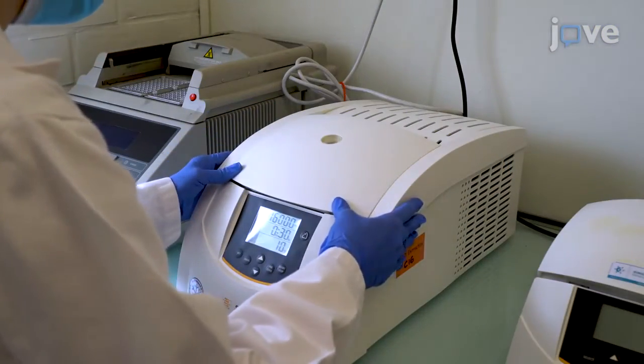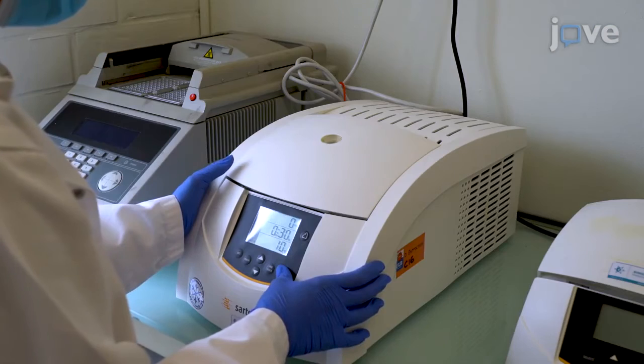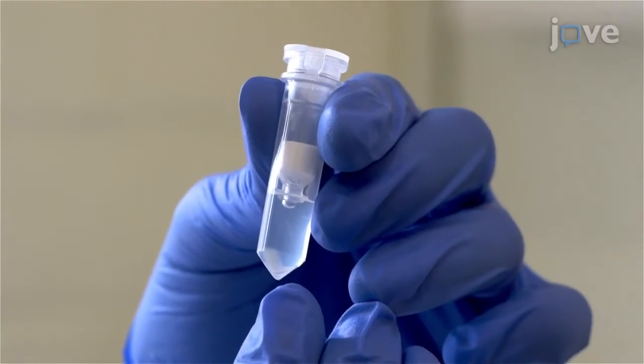our protocol is column-based, which is detergent and enzyme-free. It enables nuclear isolation in less than 30 minutes.